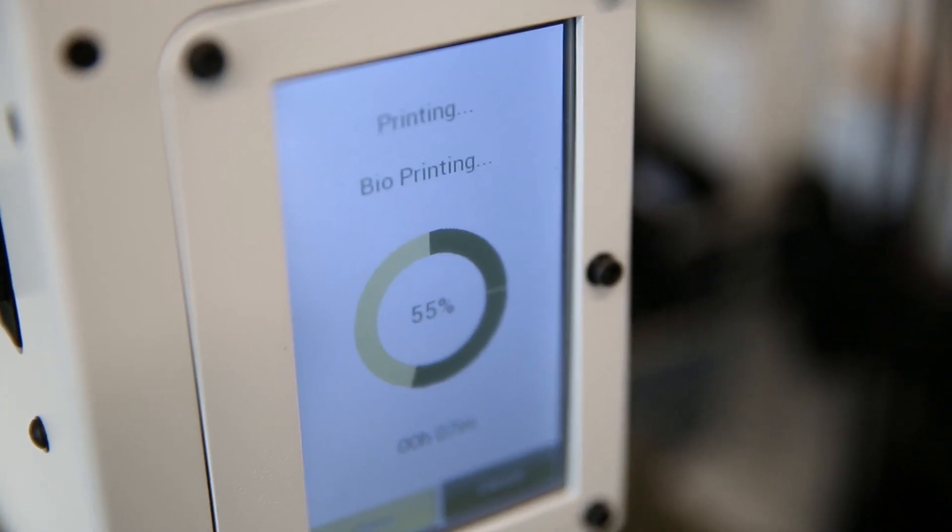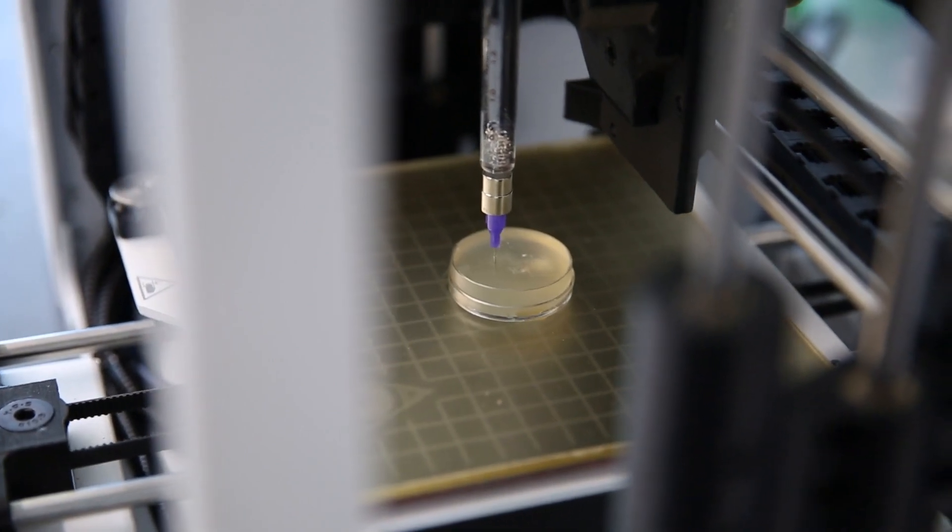Bioprinting is 3D printing but just with biological materials and cells. The idea is that with cells and these biopolymers together we can rebuild tissue structure.